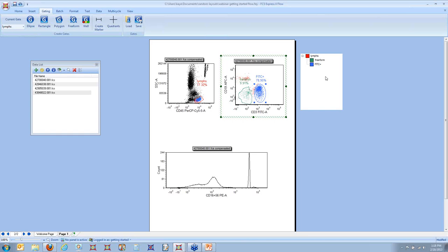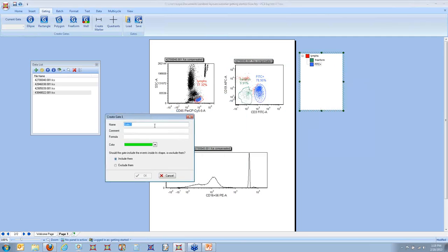Okay. Great. So that is basically how you create regular gates. From the gate view, you can also create combination gates simply by right-clicking and hitting combination gate. Let's call this my combo gate, and I'm going to give this a real standout pink color here.